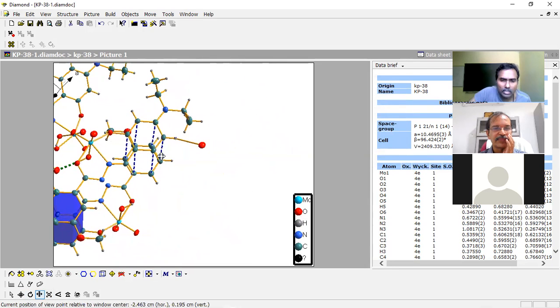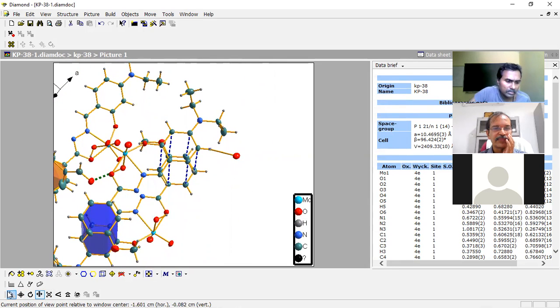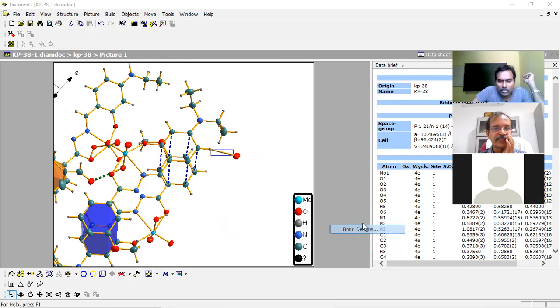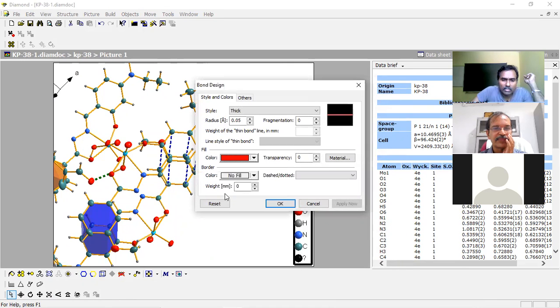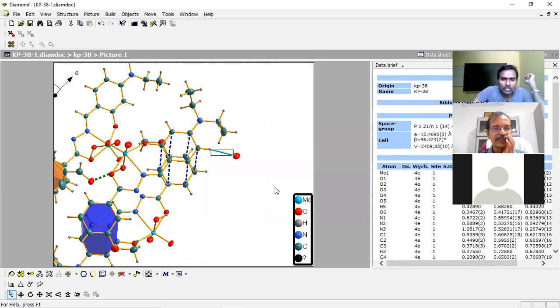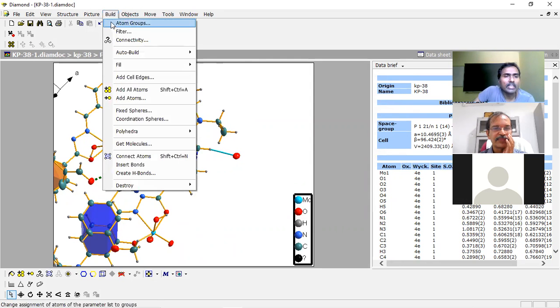So you can take it here and see this. We can now change it to a different color, because after bringing all the molecules, it is very difficult to find out exactly which molecule we have obtained and what is the atom that we have connected. So for that purpose, we can make it a different color so that we can easily find it. Or blue, or whichever one you like. So it will be different, and after obtaining this one, we can easily locate it.